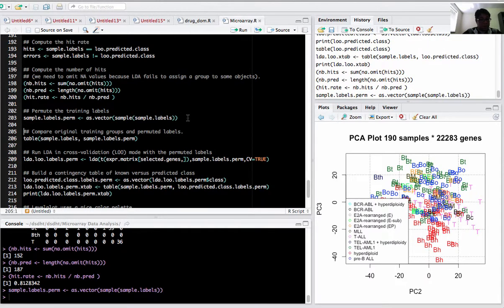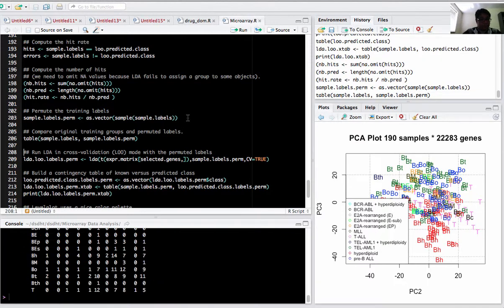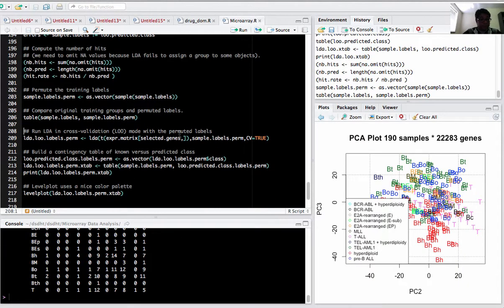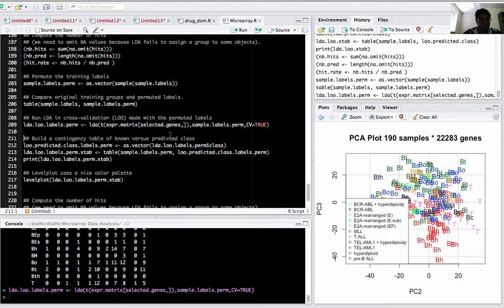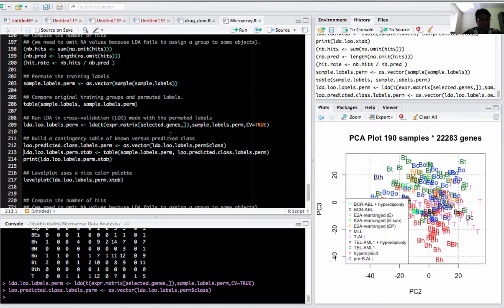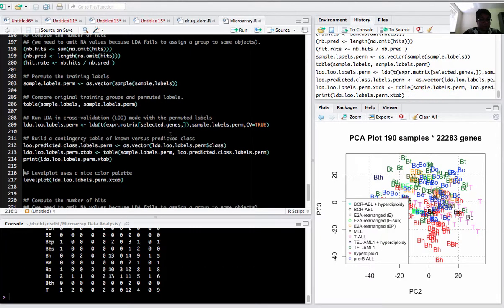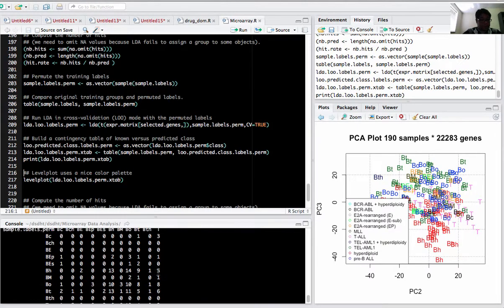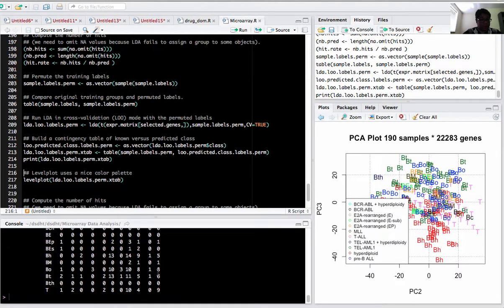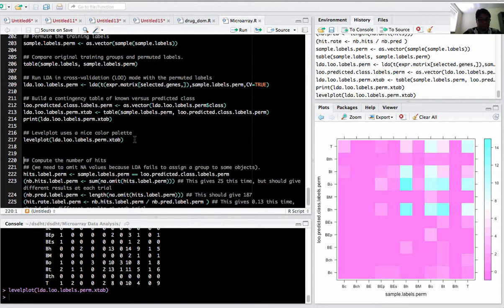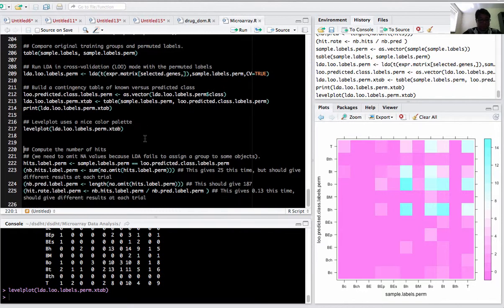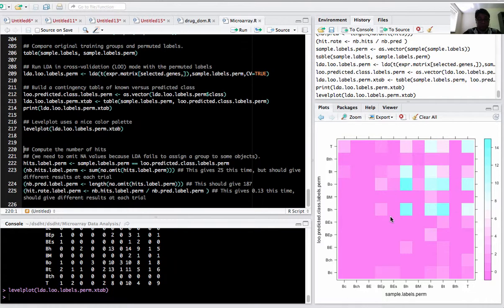Now I want to do a random prediction. I permute the labels here, compare the training groups with the permuted labels, again run the LDA on this, build a contingency table of known versus predicted class. This is a kind of random set. This is a 2D plot of the predicted results.